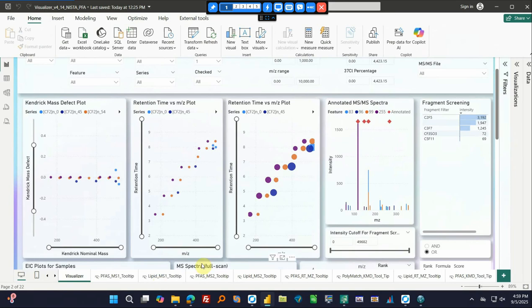Same thing with the MS1 data, which is from a deconvoluted one from the Agilent ecosystem from Explorer. And then your formula predictions are done on top of their already deconvoluted isotopic patterns. We have the molecular ions now that you can filter on. So you can pull out all of the compounds.